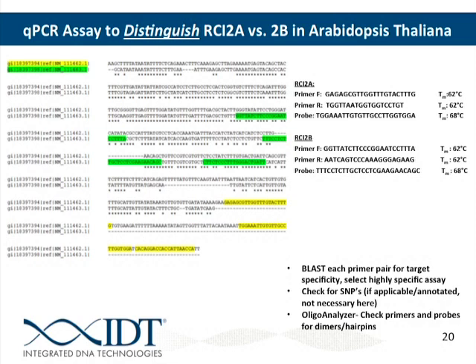So then looking at self-dimers. You can see here, this is the most stable self-dimer that this is predicting. And that's, again, well below that -9 cutoff. This is not a very stable dimer and likely won't be an issue for your reactions.